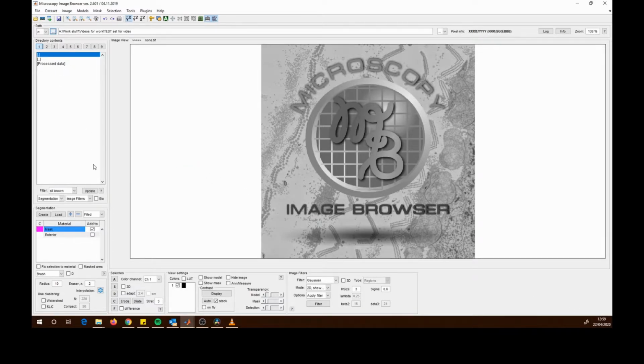If you can't see anything, once again, don't panic. It may be simply because you're looking at the raw data. The raw data from the microscope may be in one of the bio formats. Now, checking this checkbox here will display bio formats files.